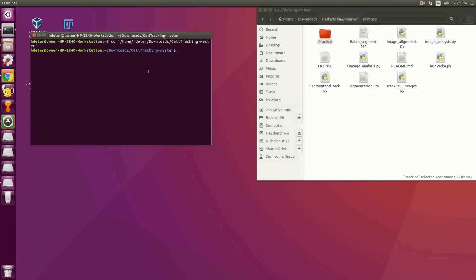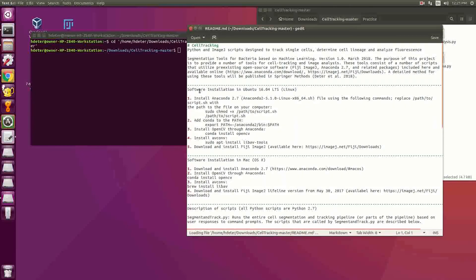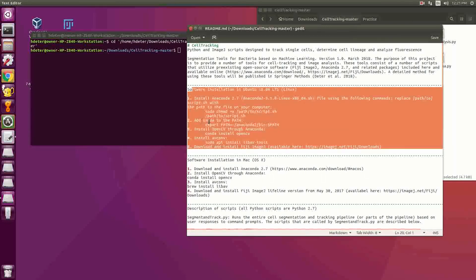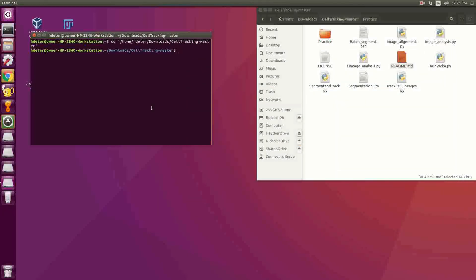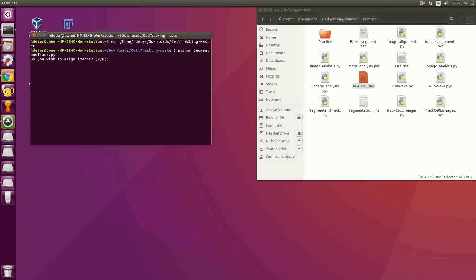Now we need to use Python in order to run the script. If you don't have Python installed, go download Anaconda — in the readme file I have a nice tutorial on all the software installation you need to do. Go ahead and pause the video, do all of that, and then come back. Now that we have Anaconda working and installed, we can just type 'python' and then the name of the script: segmentandtrack.py. You can type out the full name, or just type 'segment' and hit tab and it'll automatically fill in the rest. Go ahead and hit enter and it'll start the script.